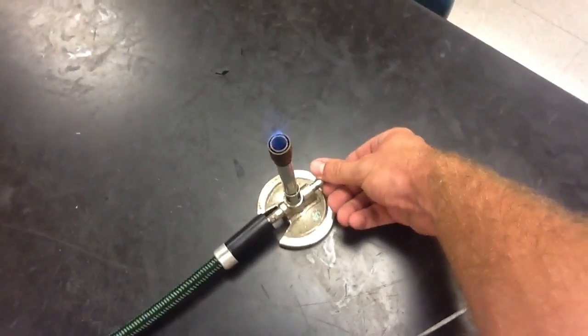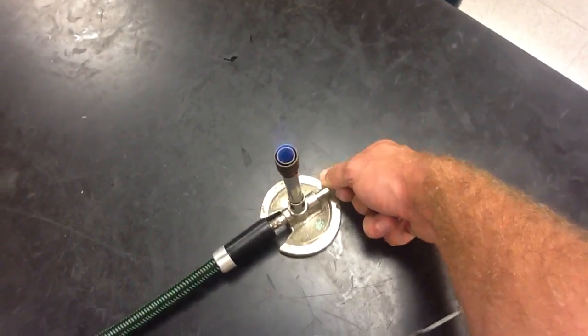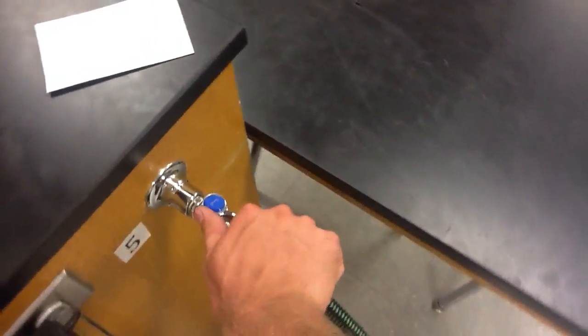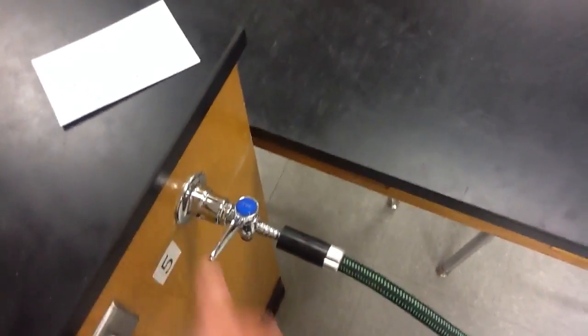When you're ready to turn it off, you can go ahead and just turn off the valve here. Wrong way. Turn it off there. And it's off. Then you can turn the gas off there. Alright, good luck.